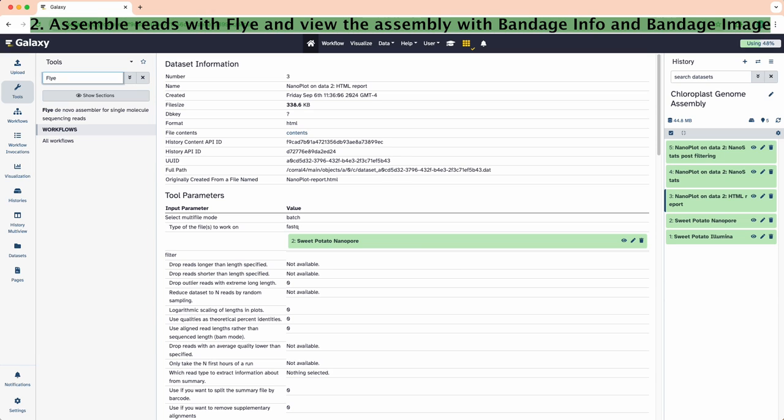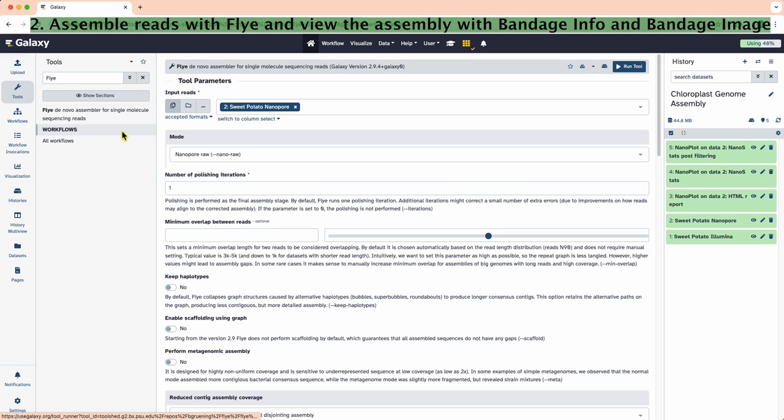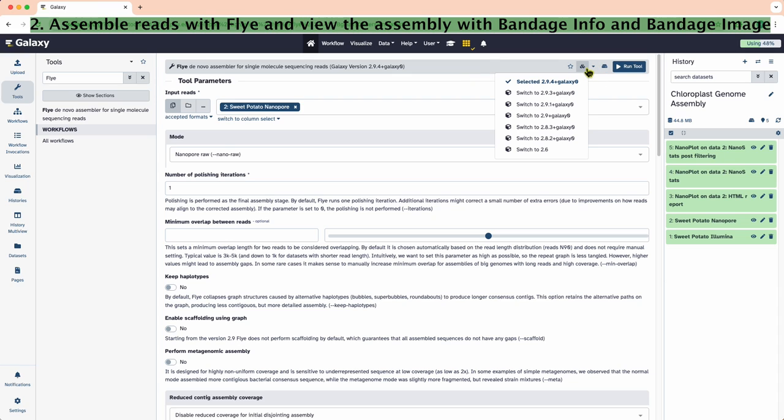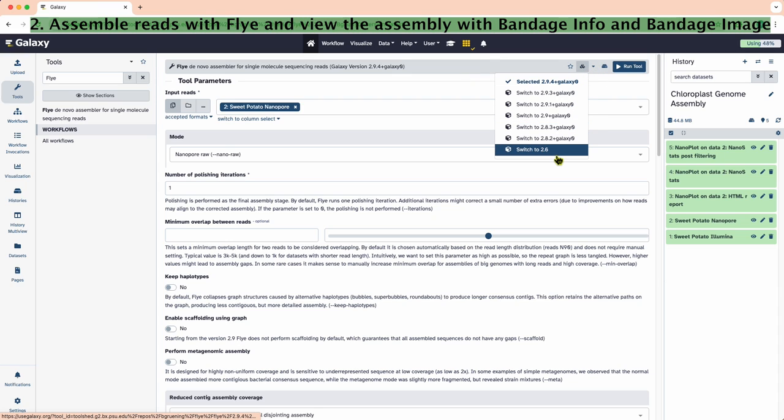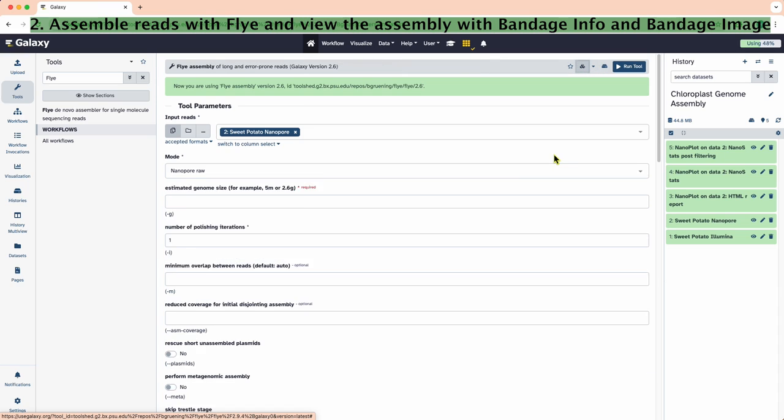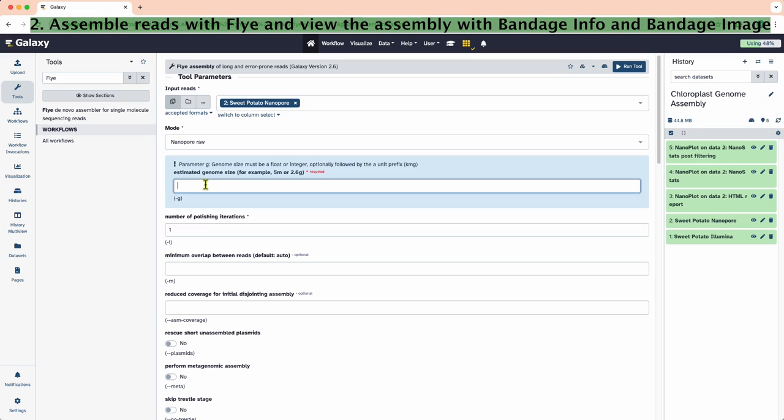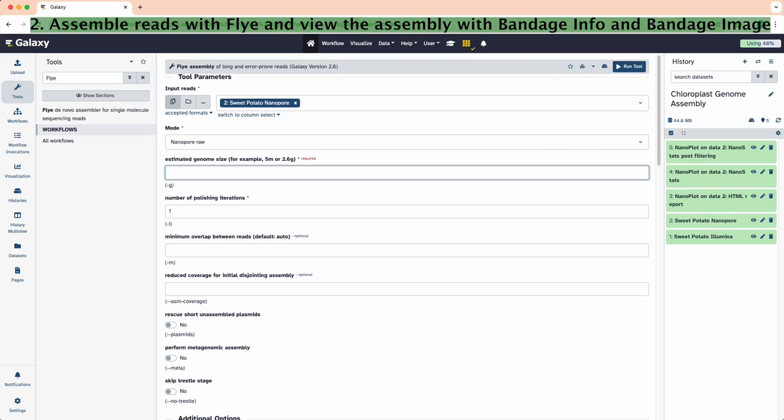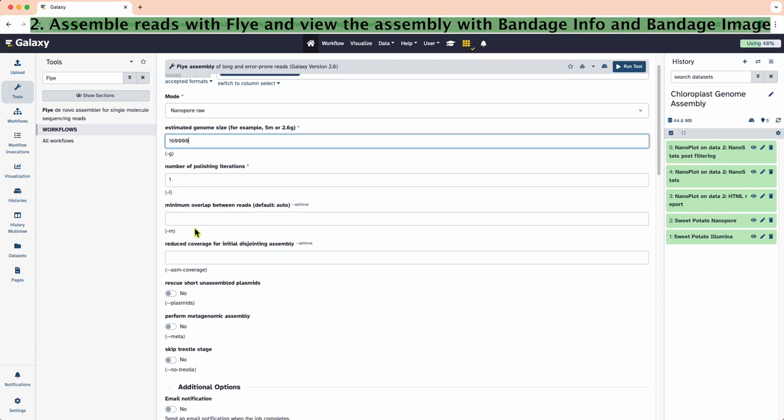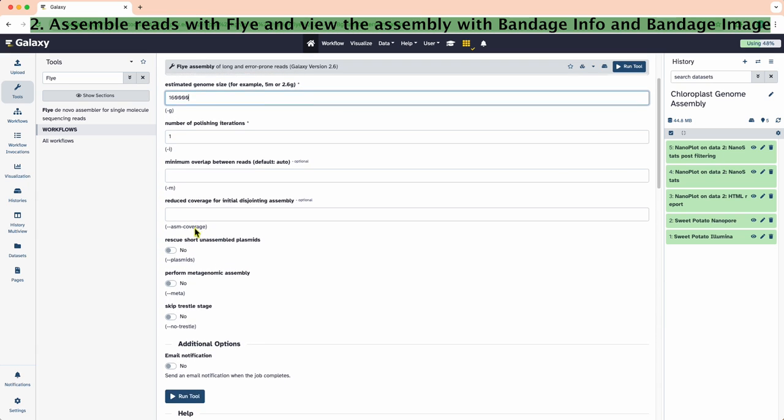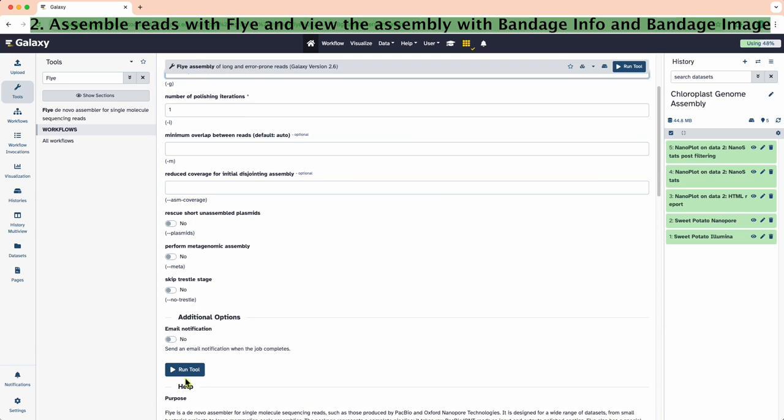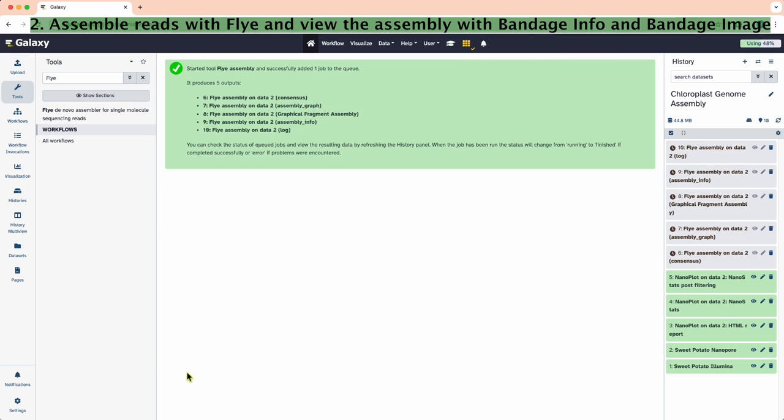Flye is a de novo assembler that does not require a reference sequence. We will use this tool to assemble the sweet potato chloroplast genome. Note that different versions of Flye may be available in different versions of Galaxy. While it is generally a better idea to use more recent versions, we will use version 2.6 here to match the parameters given in the tutorial. We will use the nanopore fastq file that has the estimated genome size of 160K base pairs. Let's hit run to start the assembly.